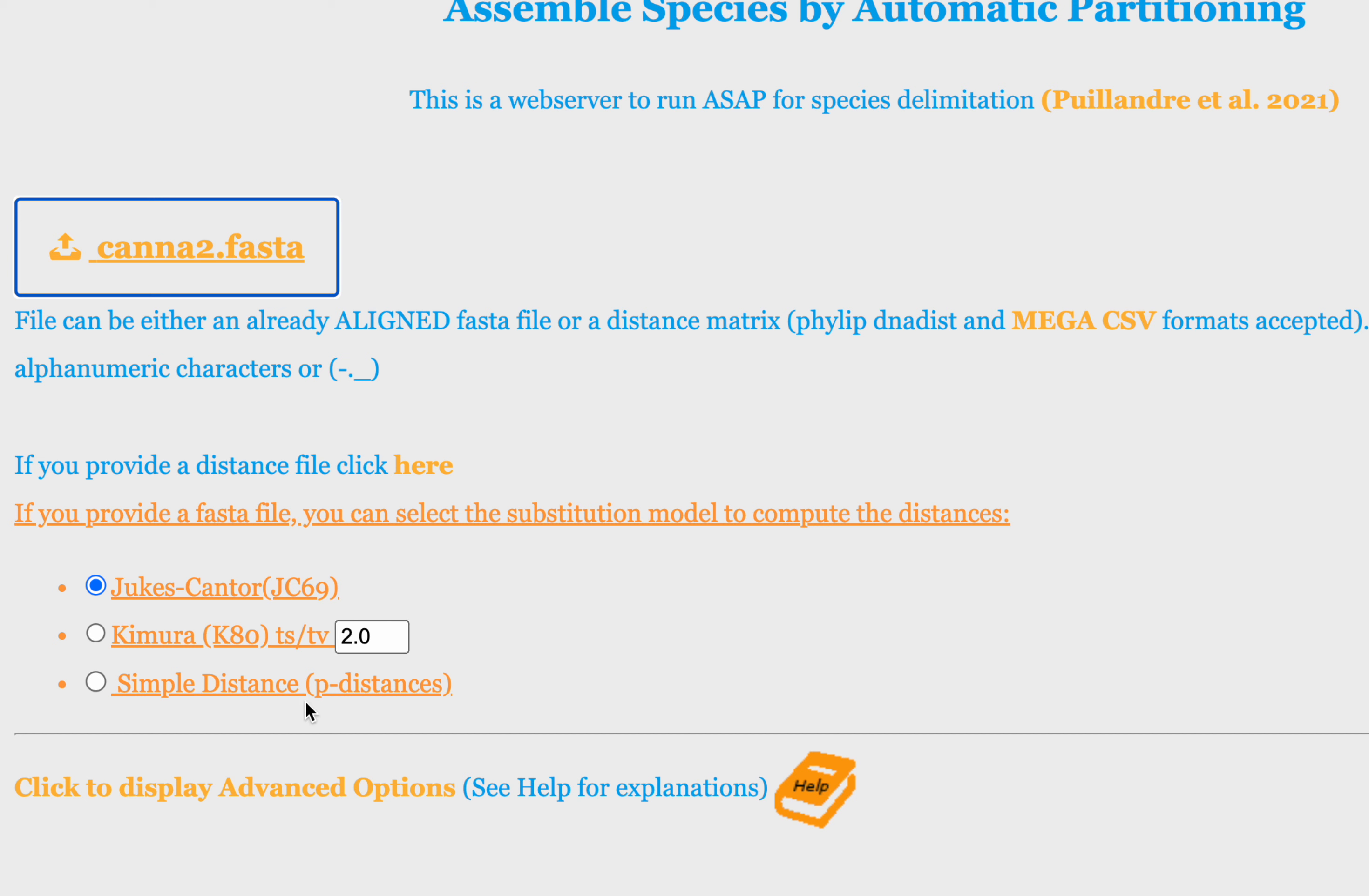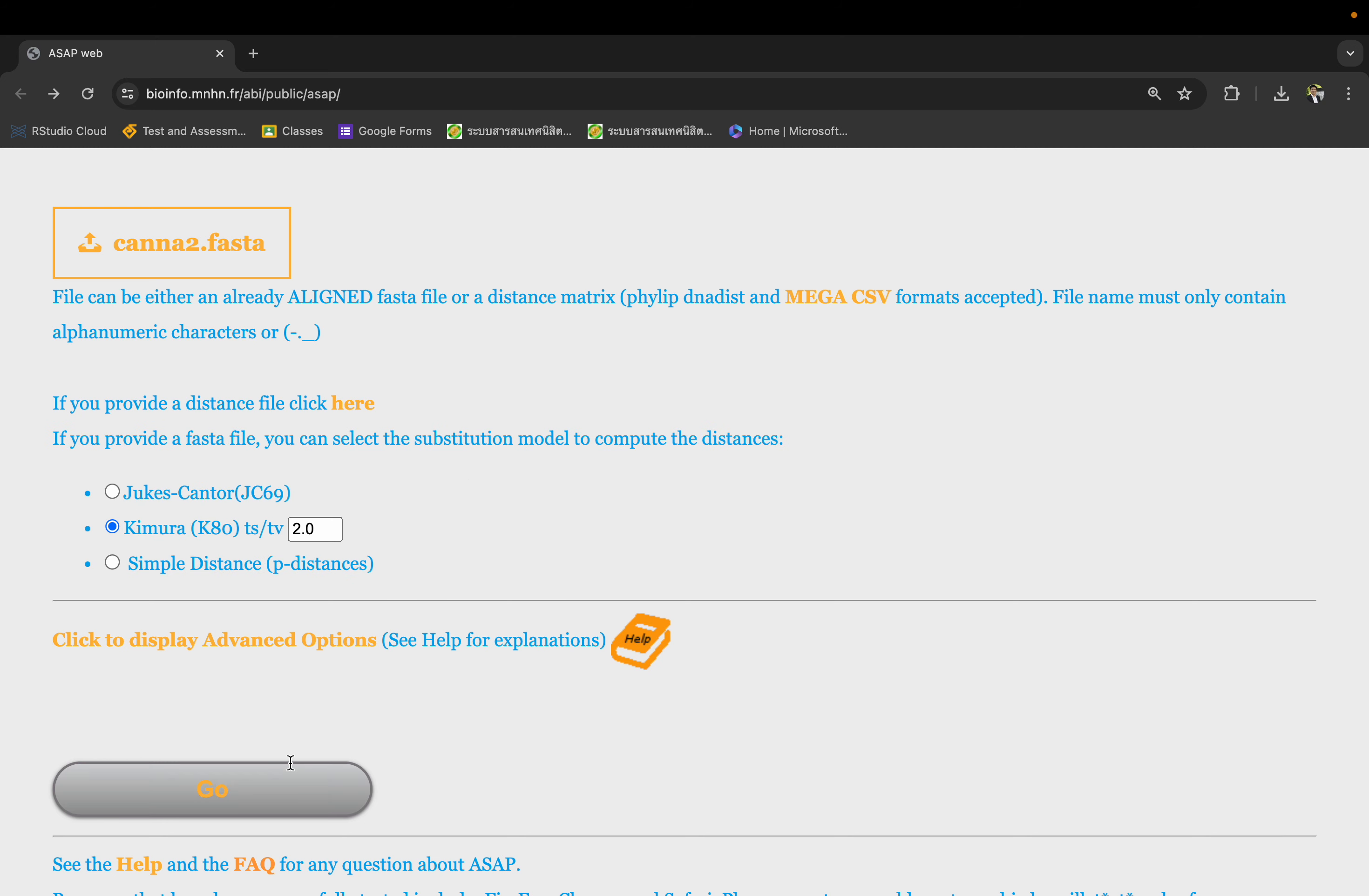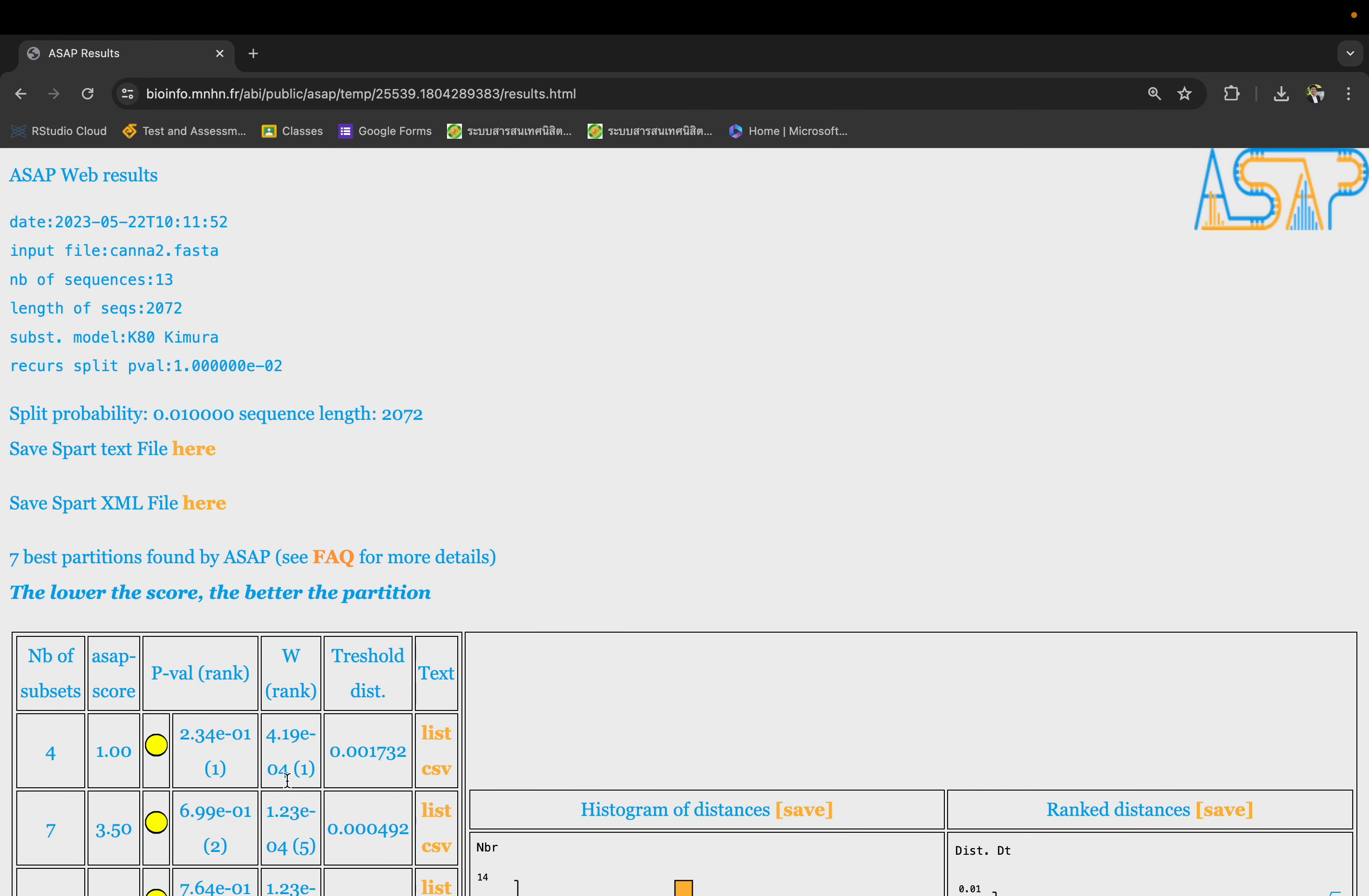The Kimura model has the transition and transversion ratio. You can leave it as default or you can have a simple P distance. If you use a barcoding region, it's typical to use Kimura distance, but you can choose any other distance as well. Once you've done that, you have your file here, you choose your distance and select go. It will take a little while to run - it won't take too long, but larger datasets will take longer.